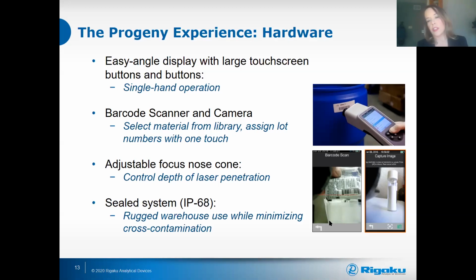So there's been some questions that have popped up around translucent and transparent containers. The rule of thumb is if you can see the product, let's give Progeny a try. If it's a completely transparent container, there's absolutely no doubt in my mind that you're going to have some success reaching your material with the laser and Progeny. Now that said, materials like amber bottles and thick translucent containers are made to block light, and laser is light. So we have to do a lot of validation and understanding around those types of containers to see if Progeny can be used with them.